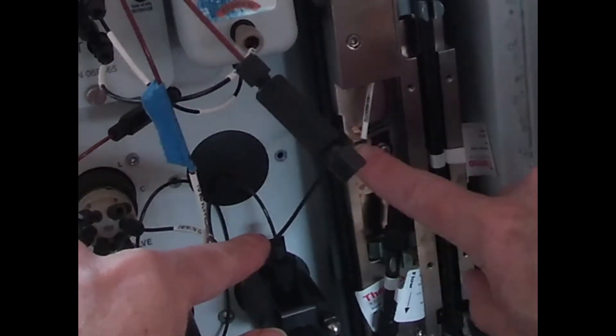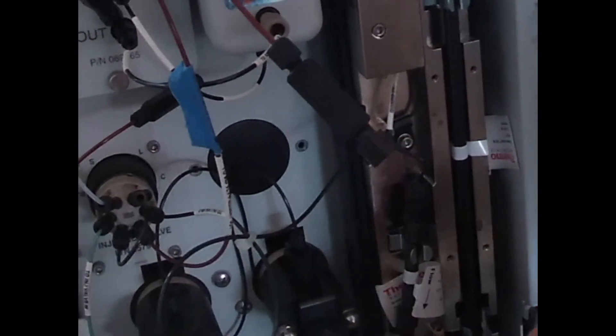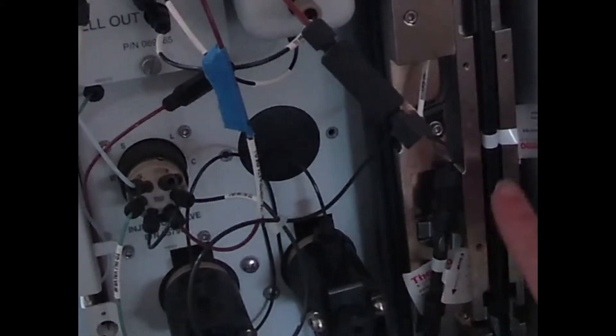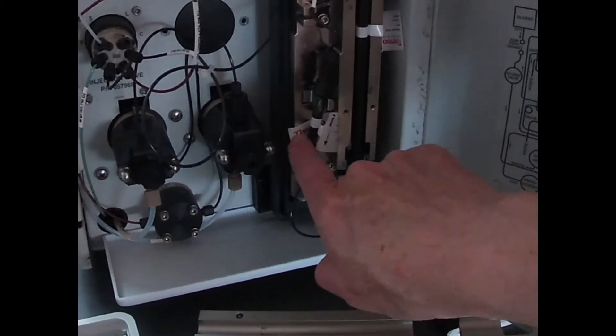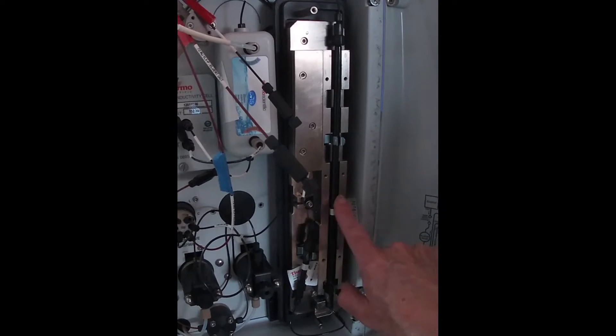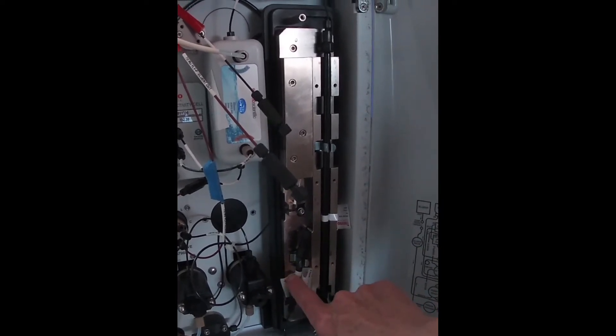So our solution first runs here and actually passes through a guard column. The guard column is made of the same material. In this case, we're doing anion chromatography, so we have a guard column that's basically there to protect our analytical column from anything that might irreversibly stick.